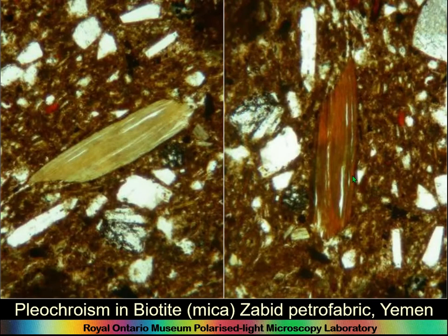I've got pleochroism in biotite. Here you can see from the Zabid petrofabric in Yemen. Here's this biotite, which I keep showing you because it's a nice photograph. And when you rotate the stage, it changes color from brown to browner.